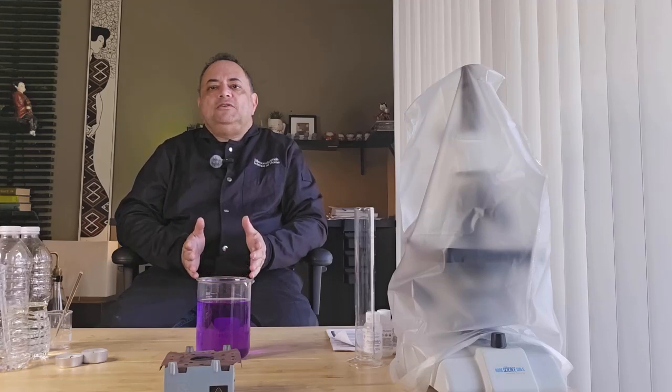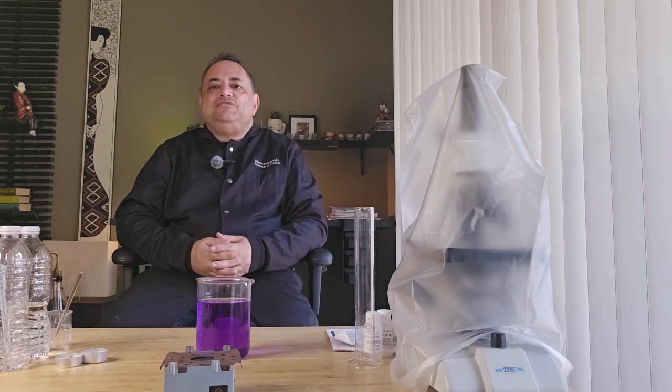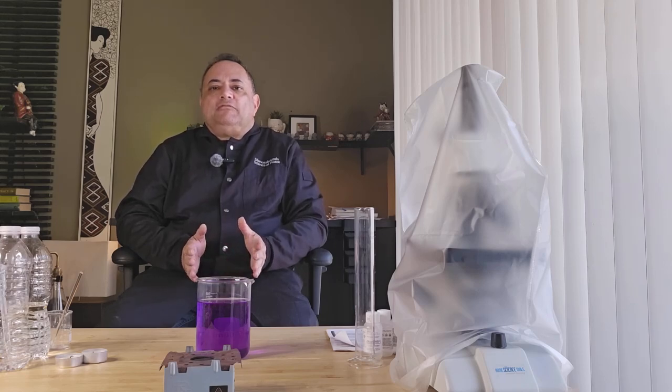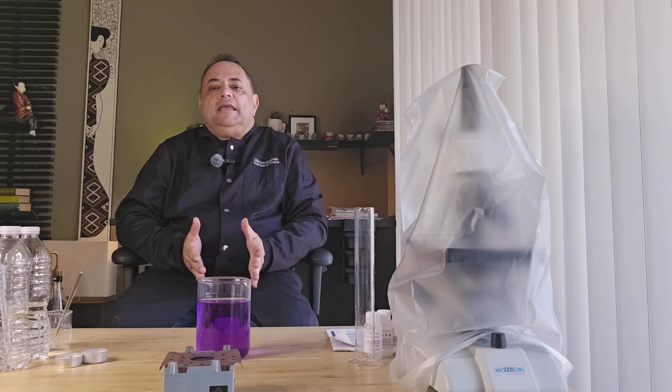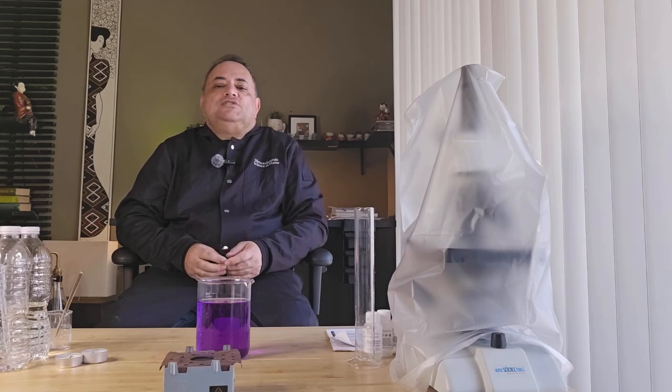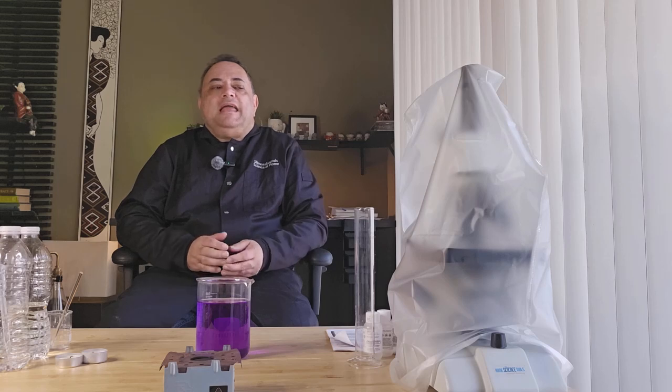Well, I hope you enjoyed that demonstration of a light-induced redox reaction. This reaction is a model system for photo-induced electron transfer. It's also studied in excited state kinetics. It is used to understand redox cycling between iron 2 and iron 3.